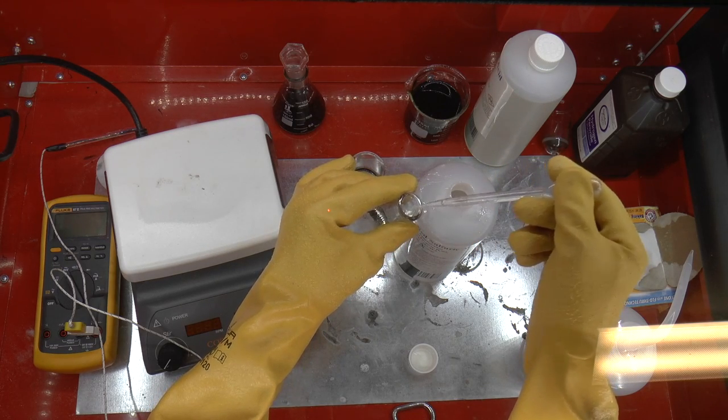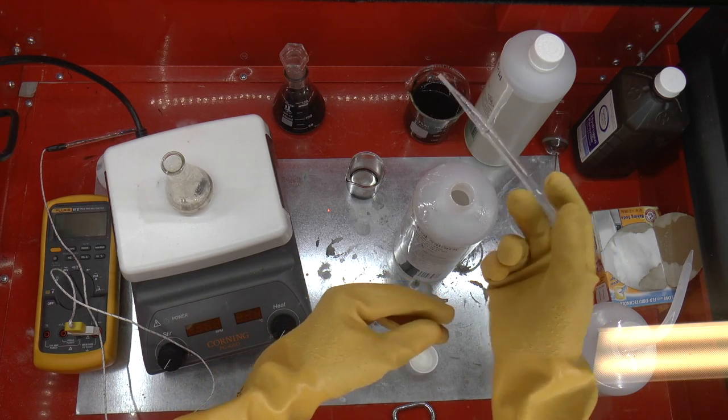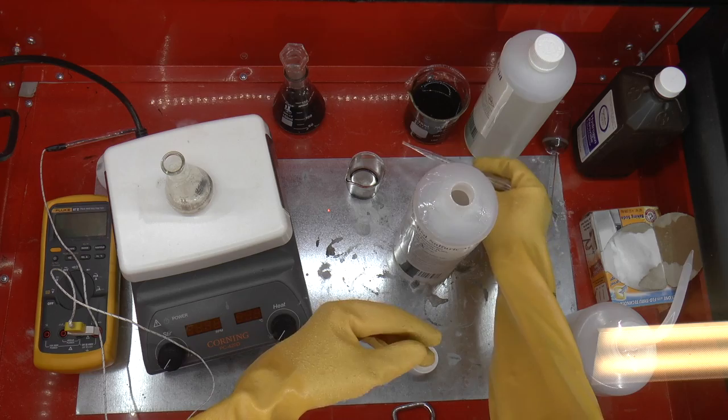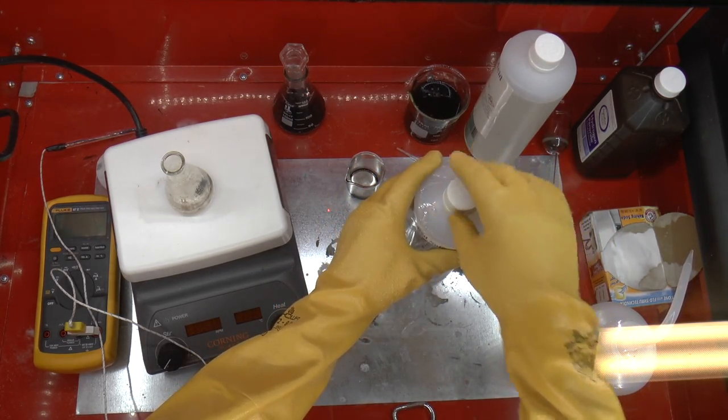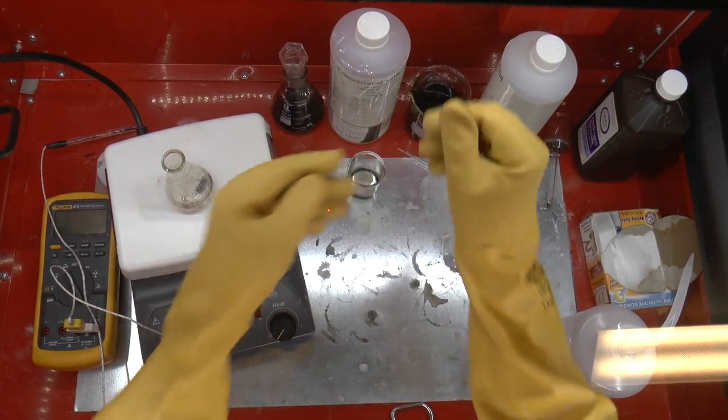Once we've finished with 20 milliliters, we're going to set it on the hot plate. I'm going to set the pipette aside because it is a little bit wet with sulfuric acid, cap off the sulfuric acid and set it safely aside.